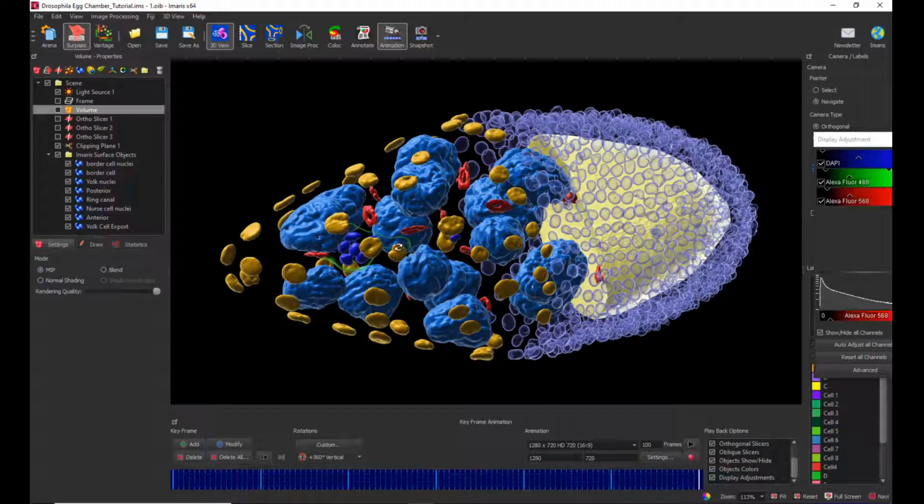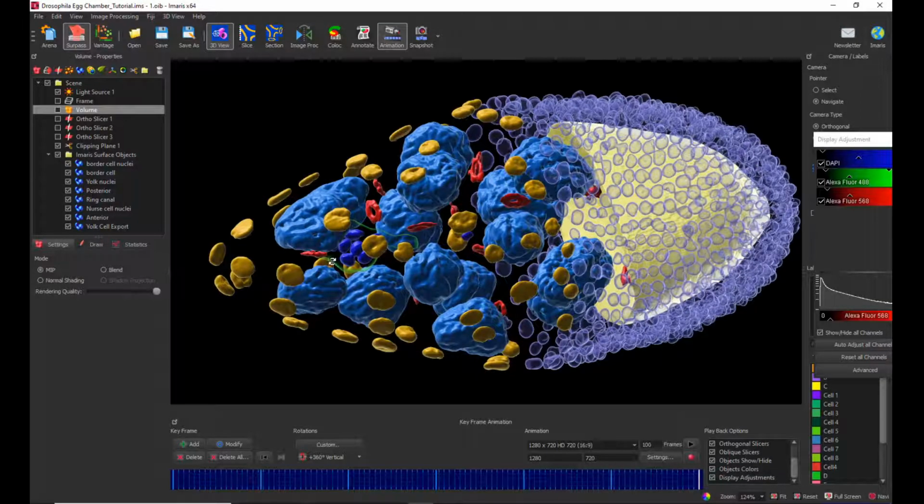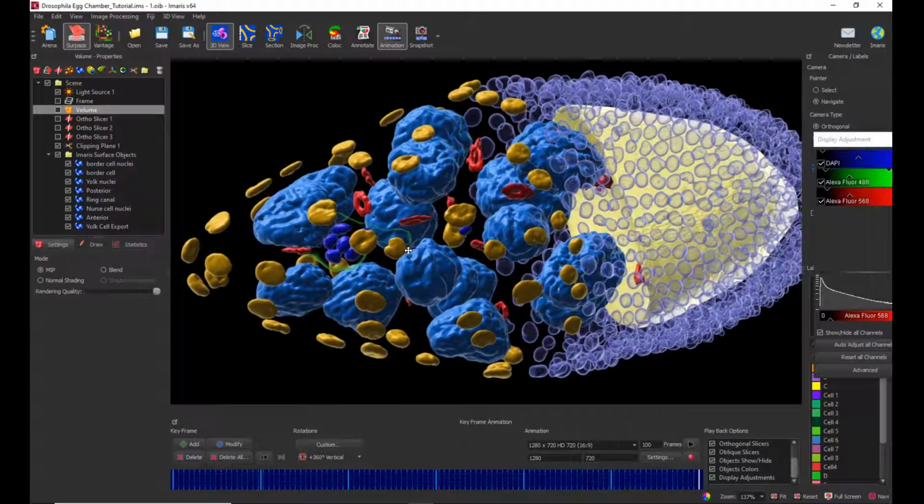Remember not to do too big rotations or zooming, because then the transition must happen too fast and sometimes the effect will not be good. So just rotate or zoom by 2, 3, 4 steps. It depends on how fast you want to go, but remember not to do too big jumps.